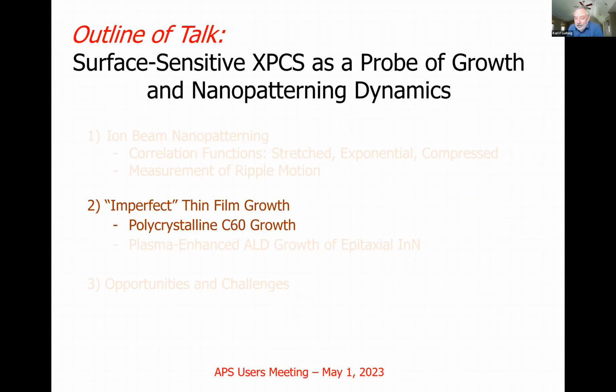Where you can look at layer by layer versus step flow, for instance, versus 3D growth. But most materials that you want in the world do not grow in beautiful layered format. They grow in more complicated morphologies. And I feel that we have a wonderful opportunity here for the coherence of the X-rays to substitute for the missing coherence that occurs in more realistic thin film growth processes.